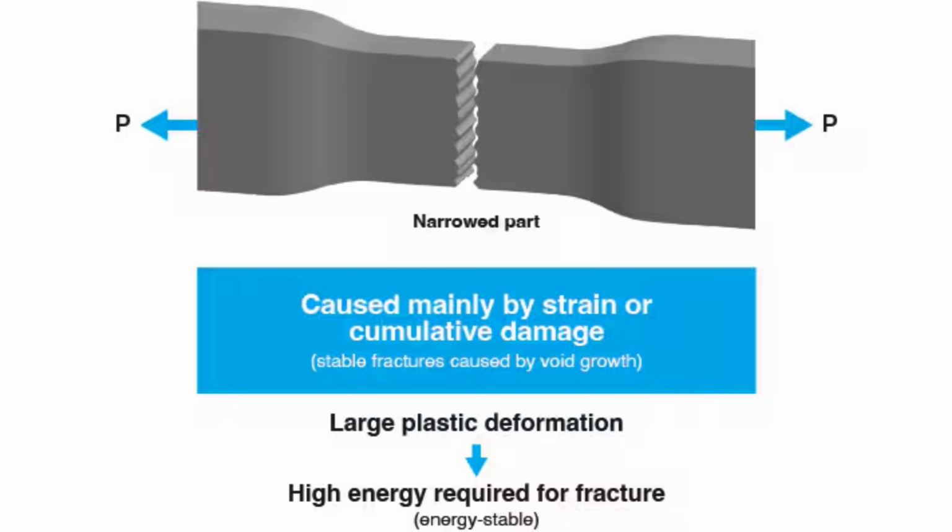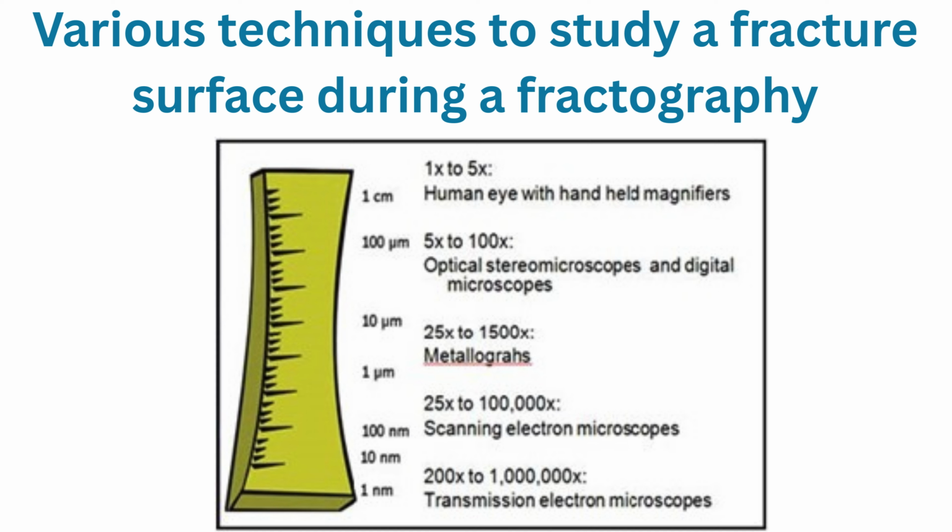Fractography is the primary technique, involving visual and microscopic examination of the broken surface to find clues about the failure. Special surface observing equipment, the SEM (scanning electron microscope), is most often used in observing the fracture appearance minutely for understanding specific causes of fracturing.